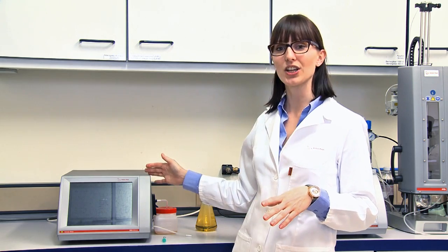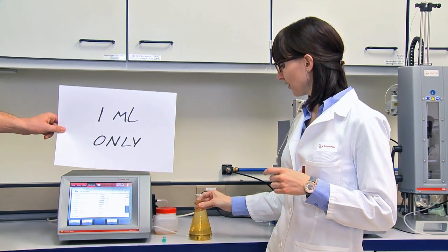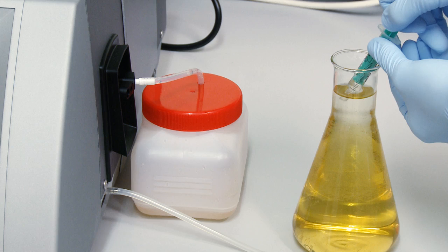As the ship arrives, you need to quickly identify the correct loading and its value. Both questions are answered by this astonishing instrument here. All you need is one milliliter of sample to precisely determine the density of the loaded fuel. So let's go!